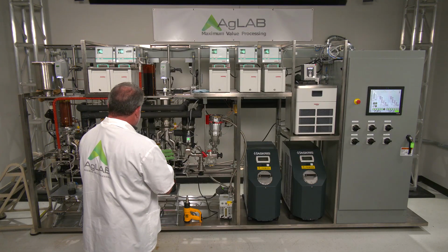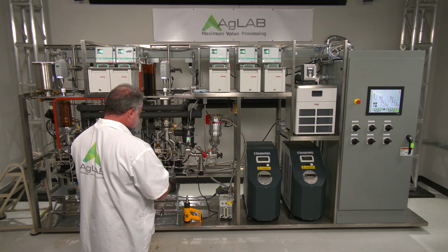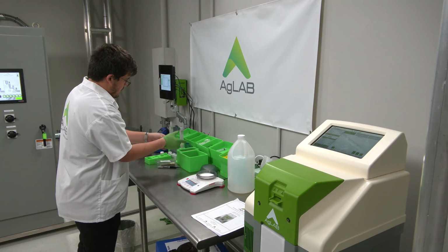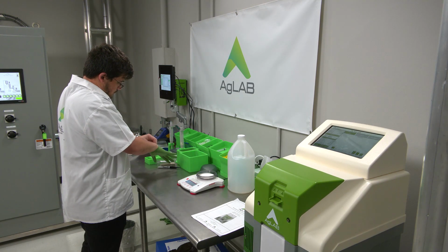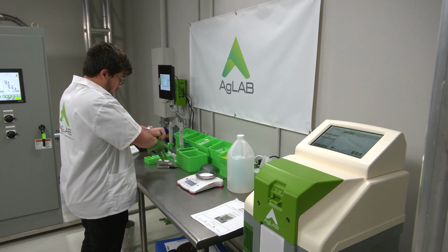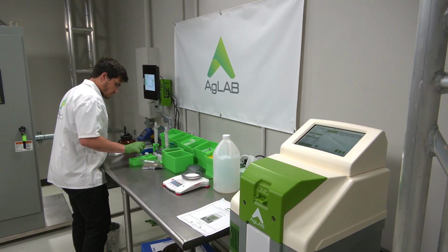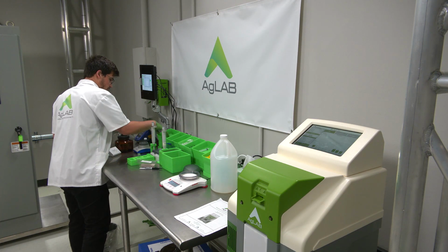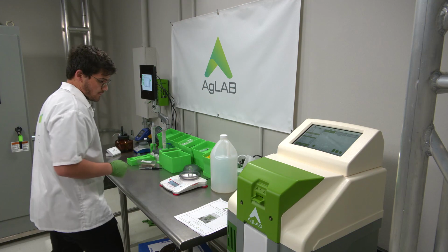All right. We're getting ready to take our first tail sample, the stage 2 residue. All right. So we're going to set up our sample vials over here. This is the vial that we're going to collect in.